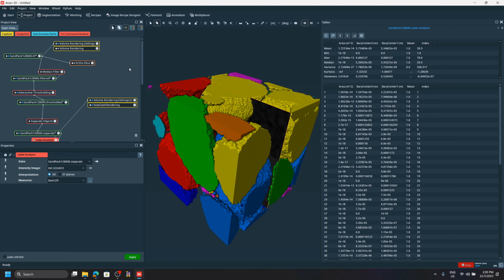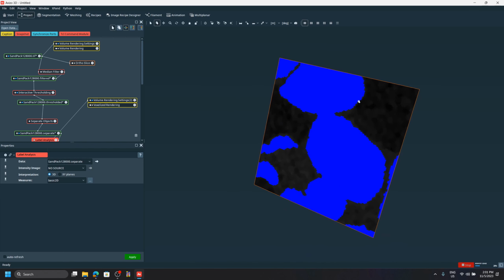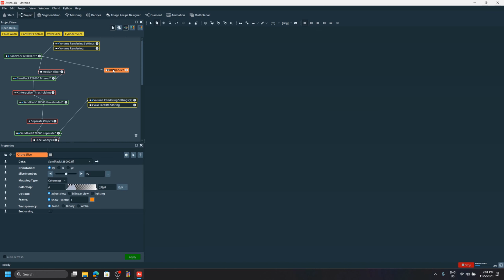Yeah? Just a short question, is there any form of segmentation? Yeah, well, you're the expert, so you have to inspect, right? So that's a good question. Yeah, your eye. Well, it depends. So for example, let me talk about the first option first, which is by eye. So you're the expert in your data, so you should be able to judge if your segmentation is correct.